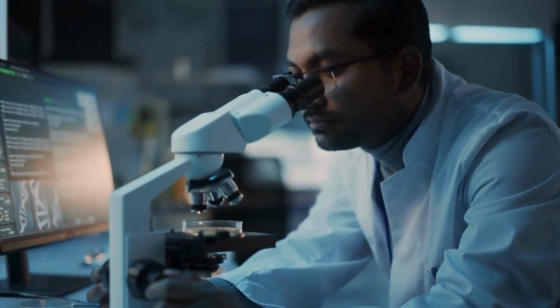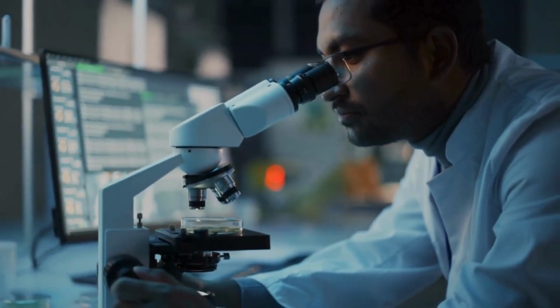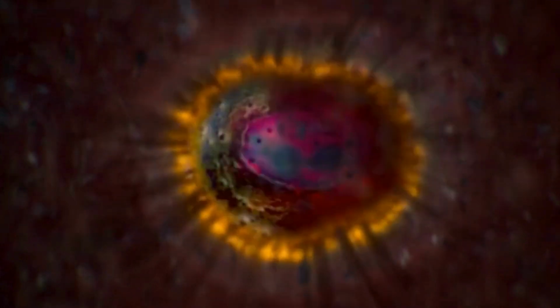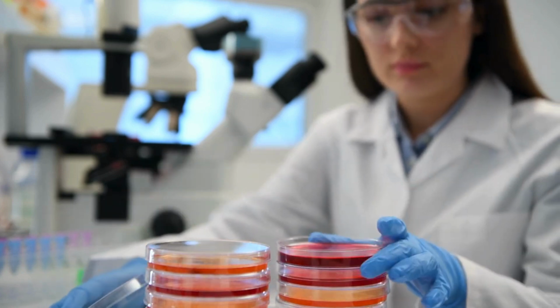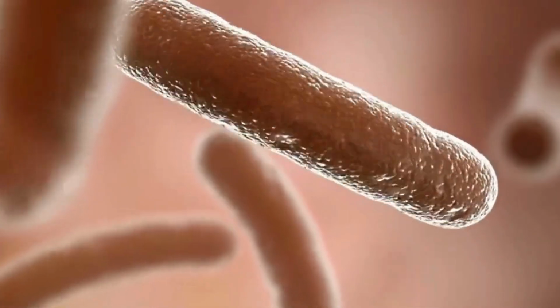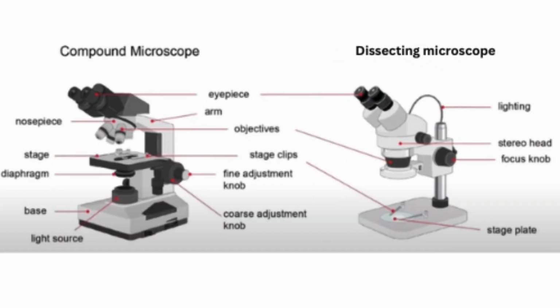The ratio of increased image to that formed on retina of an unaided normal eye is termed as magnification of the microscope. The term resolution or resolving power refers to the ability of a system to distinguish two close points as two separate points. Human eyes have a limited resolving power and cannot distinguish the object smaller than 0.1 mm, 100 micron. To study the organisms which are smaller than 0.1 mm, different microscopes are used. At 10+2 level, both dissecting microscope and compound microscope are very commonly used by the students.